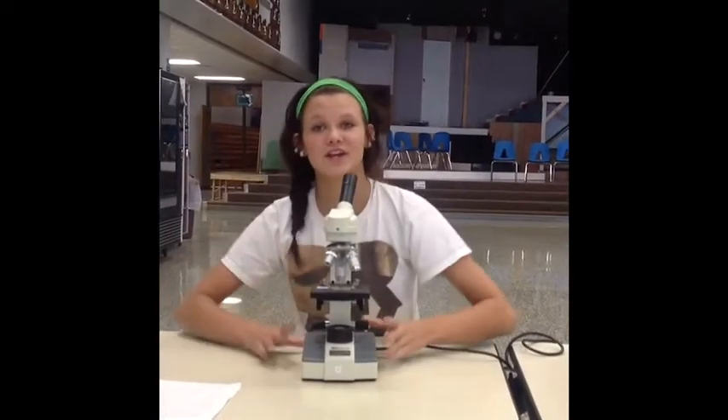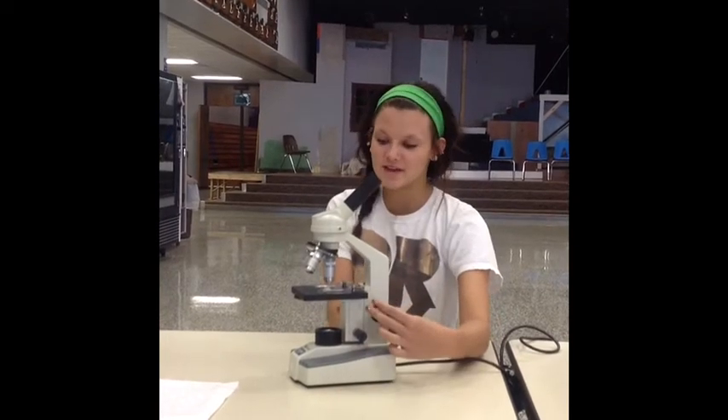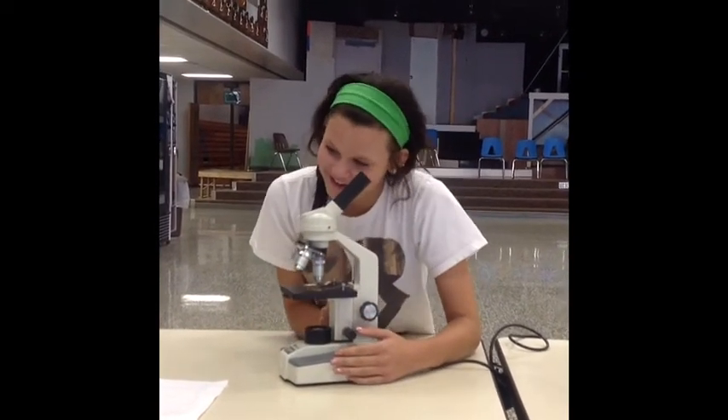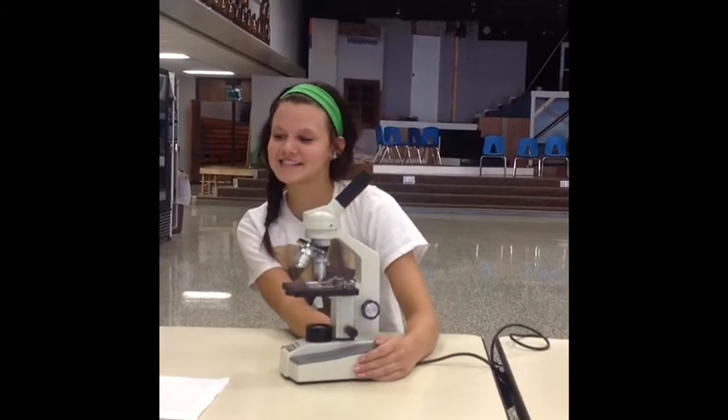If you still cannot see the specimen, you may adjust the stage by moving the coarse adjustment knobs. When your specimen does come into view, you know that you have mastered the task of the microscope.